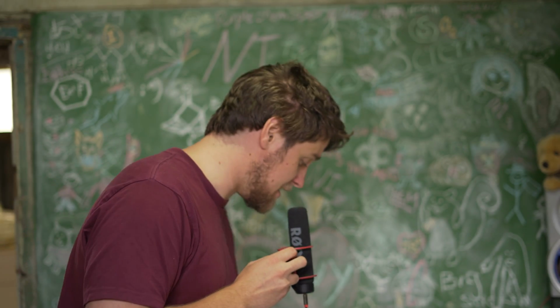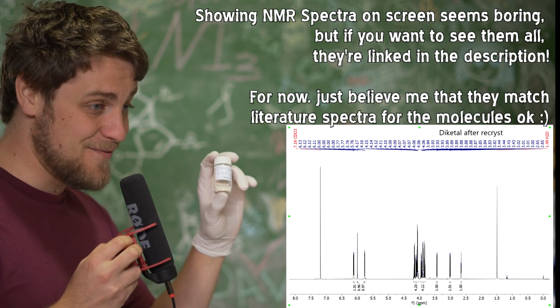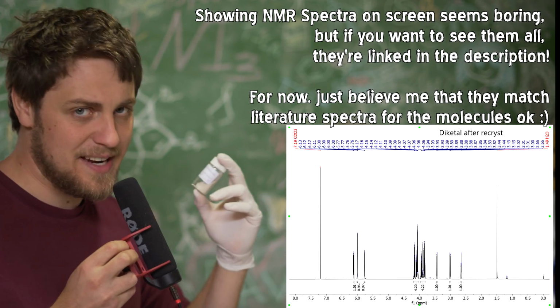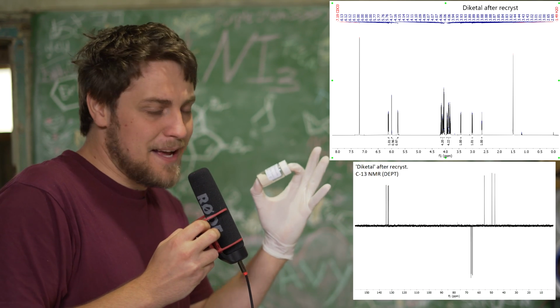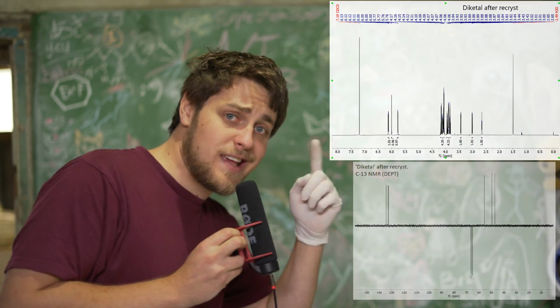Beautiful. And it continues. Recrystallized Diels-Alder product is very pure. Well, I mean, it's not sensationally pure, but sorry, I'm getting excited, I'm getting carried away. Even though there's several isomers of this you could form in the Diels-Alder reaction, we didn't pick up any peaks of anything else in there. It's like 99% pure, this is. And you know what? It continues getting even better.